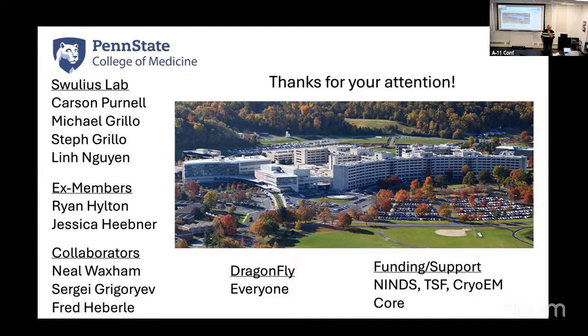How long does it take to train? We can train some this afternoon. It depends. If you make it really generalized and you have like 20 different synthetic tomograms being input, but I'll show you what you can do from one 400 by 400 by 50 voxel input. You can make a network that is like 90% of what you need it to be with that amount of data, and it takes 30 minutes to train.